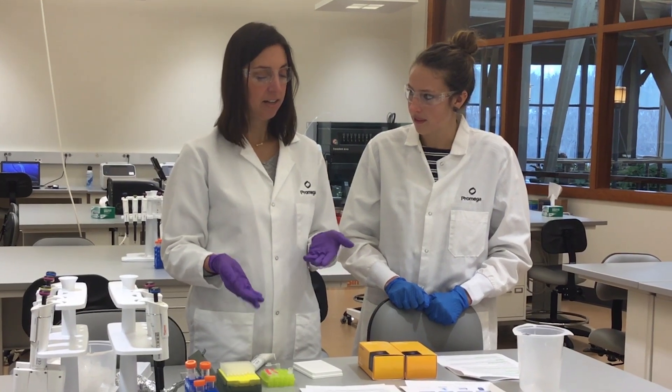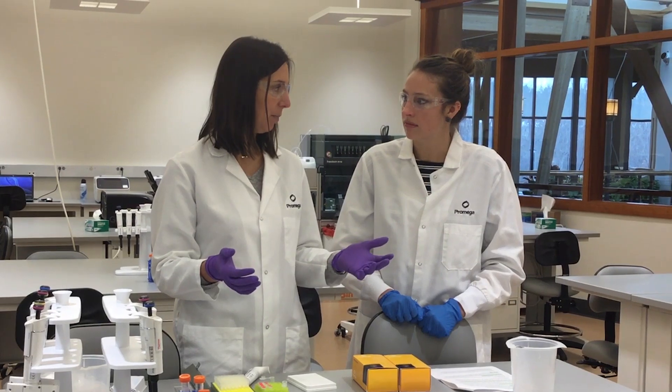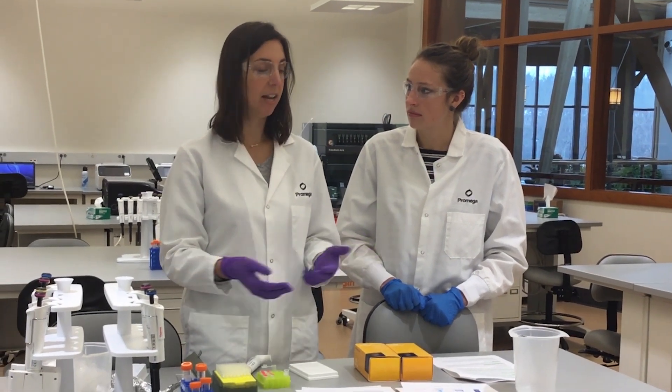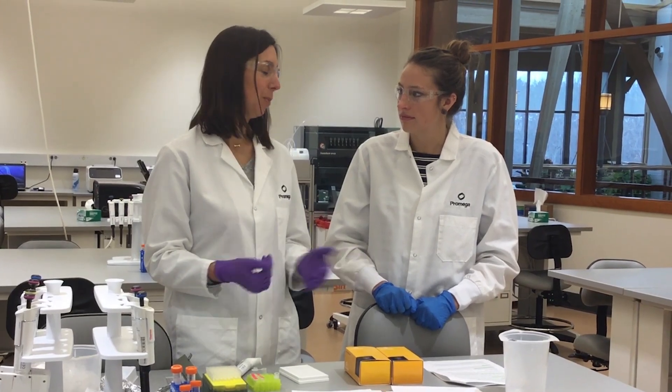Once that's done, you add in the Cas9 and that's going to form the full ribonucleoprotein complex. It's just a room temperature incubation for about 10 to 20 minutes — also super easy.